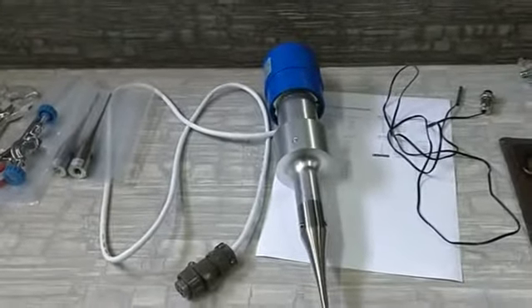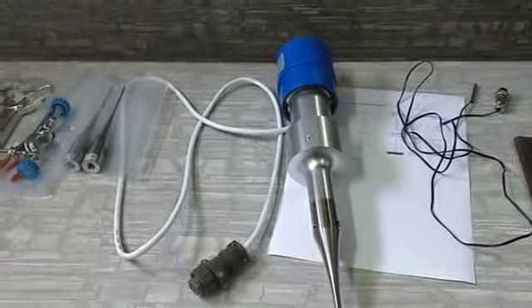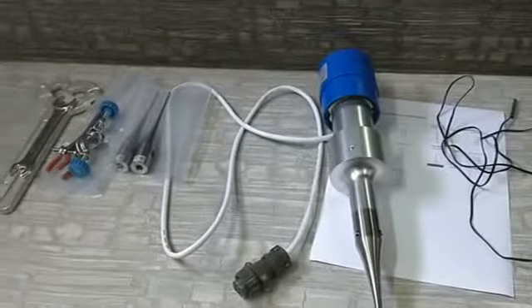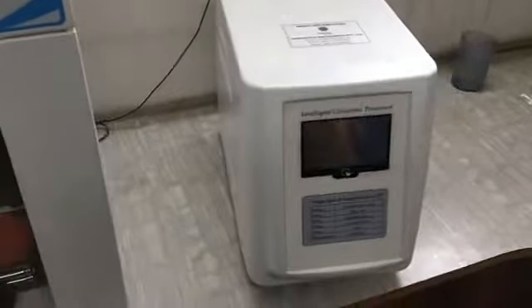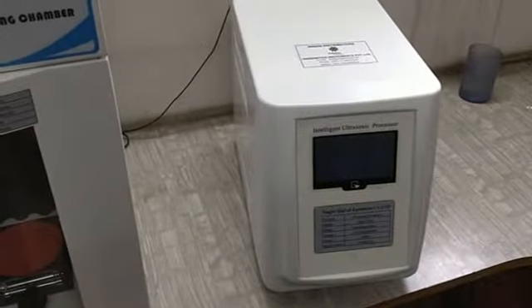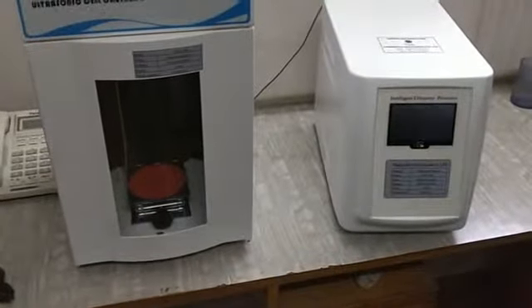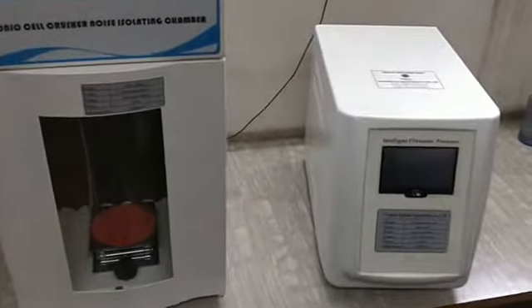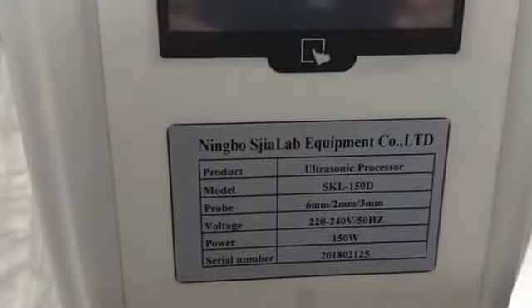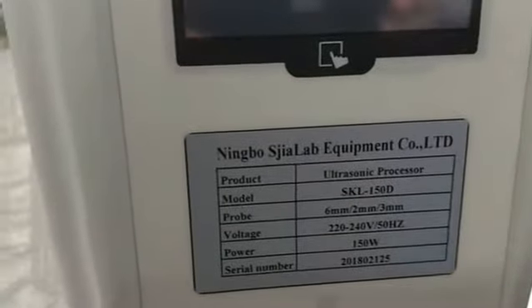The most important thing about these machines is that they come in different wattages, right from 150 watt to 1800 watt. The higher the watt means you can do higher volume lysing of the sample. This particular model is basically 150 watt. This model can take only probes of 2mm dia, 3mm dia, 6mm dia, and 8mm dia.